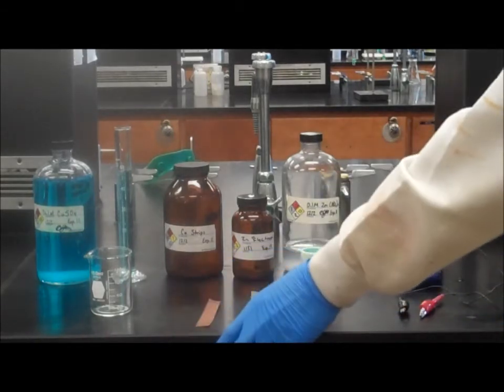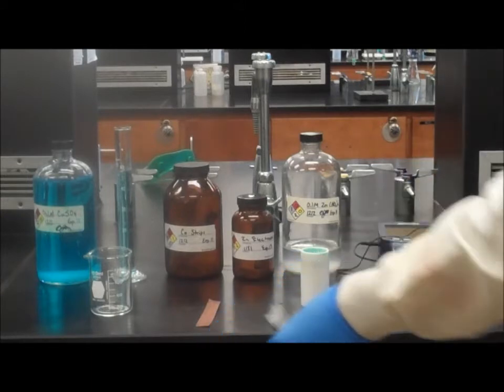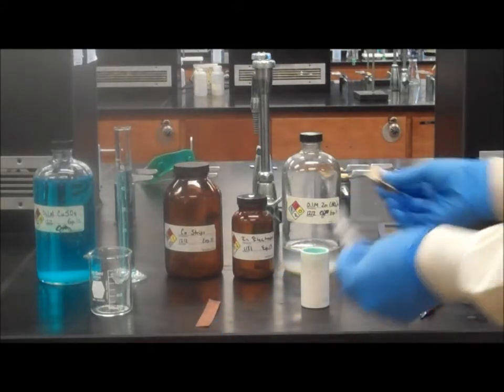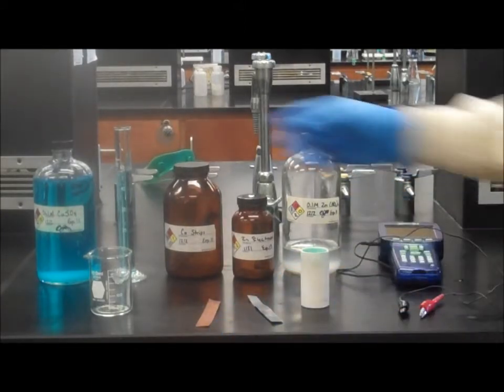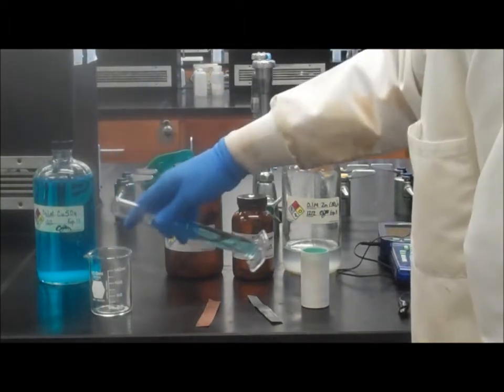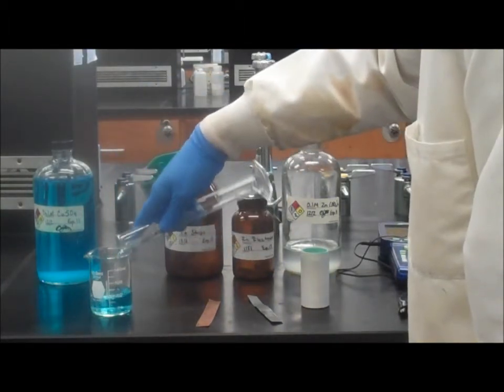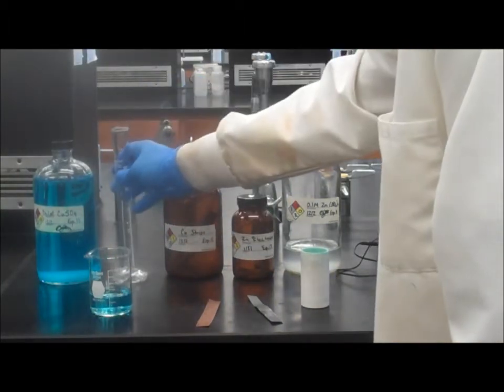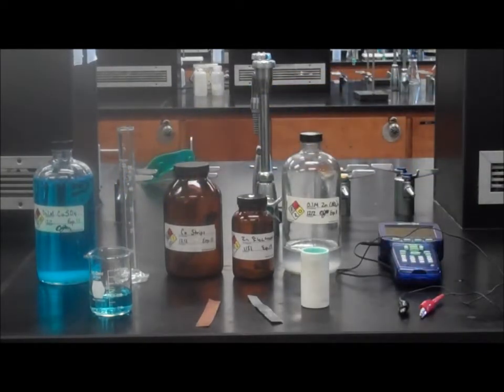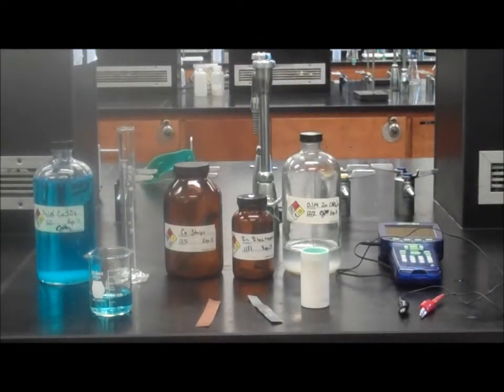Pour approximately 50 milliliters of 0.1 molar copper sulfate into a 150 milliliter beaker. Next pour 0.1 molar zinc nitrate into the porous cup until it's two-thirds full. Then place the porous cup into the CuSO4 solution.